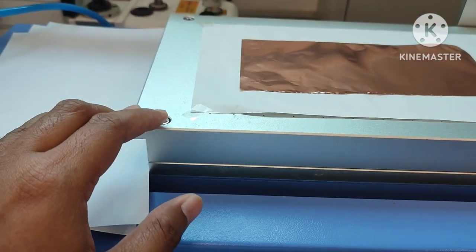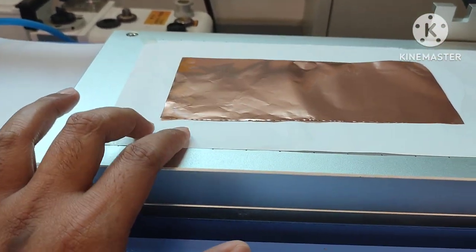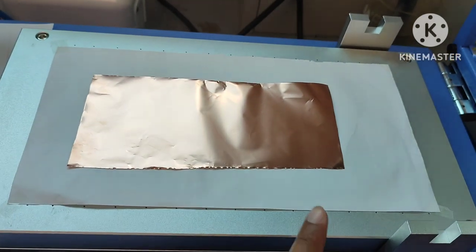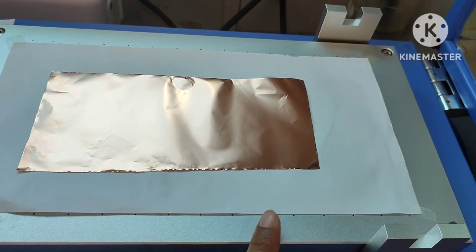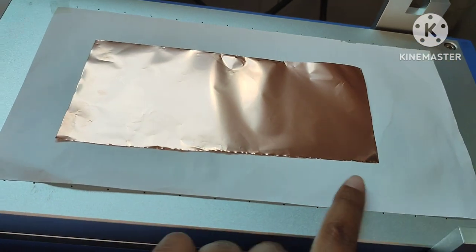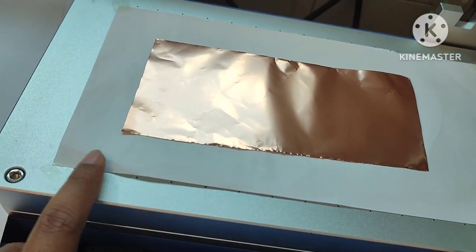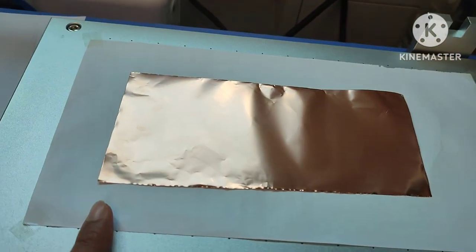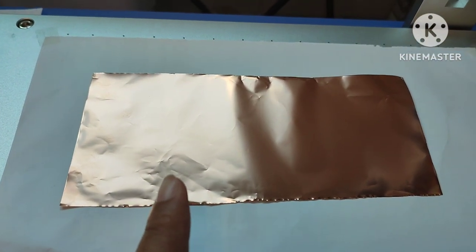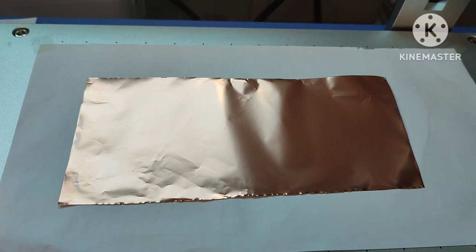Next, what we're going to do is place the A4 paper. Make sure the A4 paper is not too big, because it will affect the cutter. Make sure it's smooth and without bubbles. We also need to clean our copper foil with acetone. Then it's ready to go for coating.